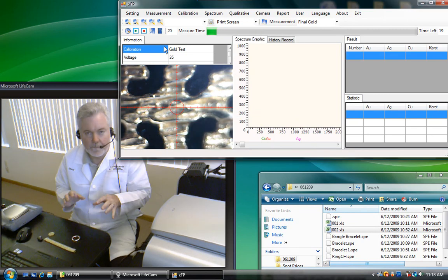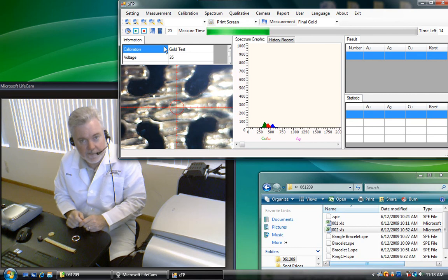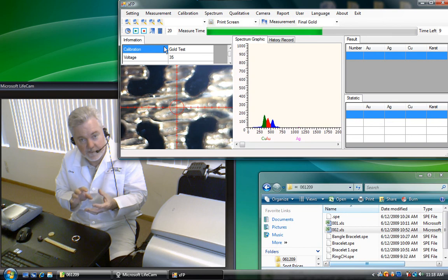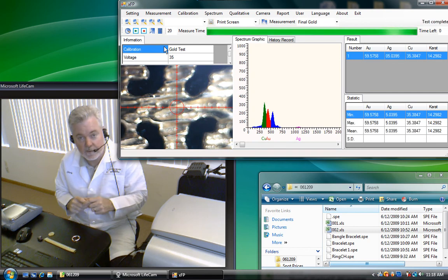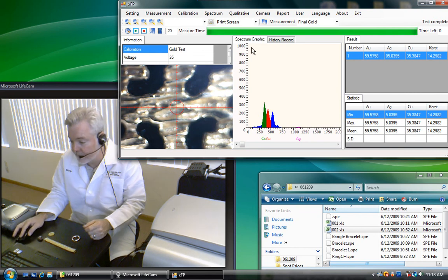And now what's happening is the instrument is sending a really fine beam of X-rays at your bracelet. And that excites the molecules in the bracelet, which move to a higher energy state, and as they relax back to their normal energy state, they emit radiation at a very characteristic frequency, and that's what the detector in the machine reads, and that tells us precisely what the item's made of. And what it's telling us today is that this item, this would be a 14 karat gold bracelet. But it actually has a little bit more gold than that in it.